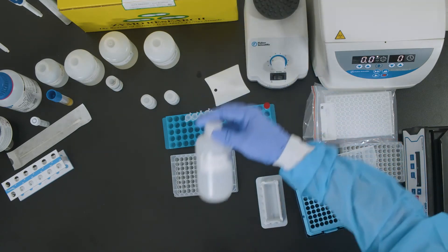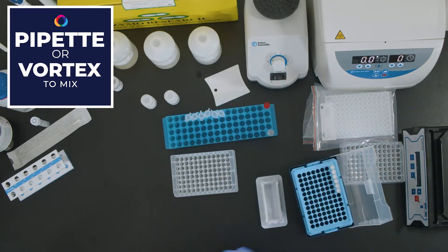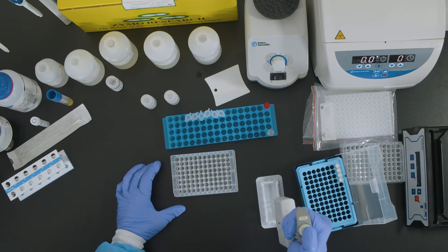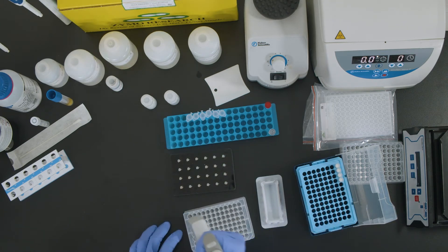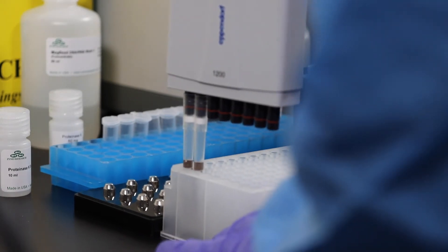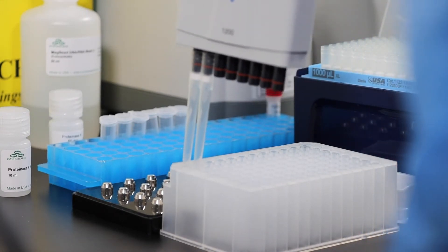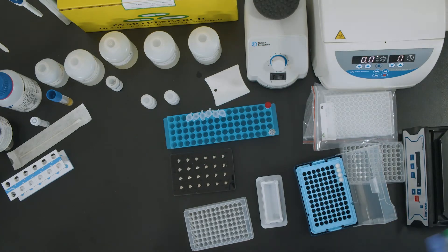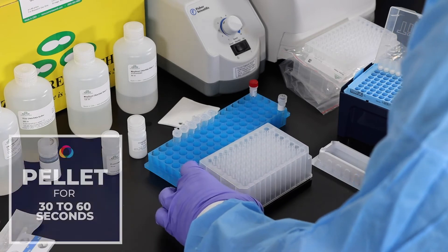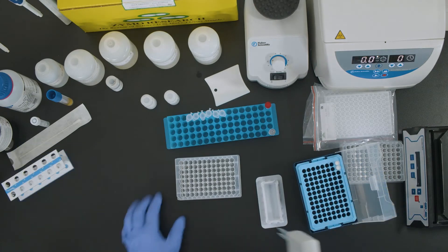Add 500 microliters of Mag Bead DNA RNA Wash 2 and pipette up and down to mix in plates, or vortex to mix in tubes. Transfer the plate or tubes to a magnetic stand and allow to sit until the beads have pelleted, approximately 30 seconds. Aspirate and discard the supernatant and retain the pellet.